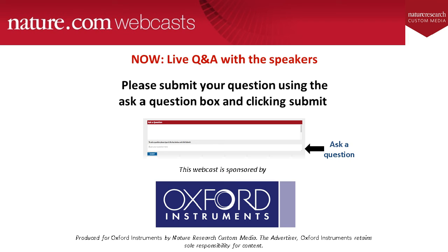What else? So there are different tags. I spoke about Apex in my presentation. That's a genetically encoded tag for EM. There's also other ones like Minisog, which works in the same way, where you get localized accumulation of osmium, which tells you where your fusion protein is.